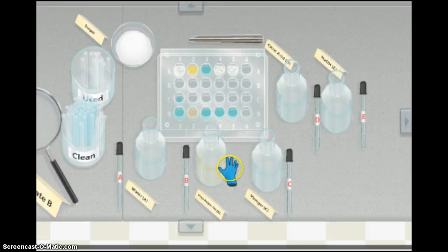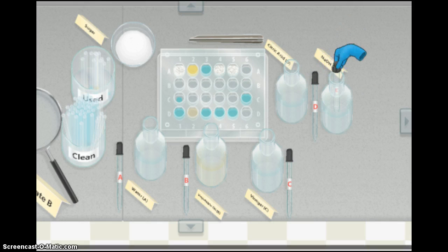All right, now I kind of want to try something else because remember how our vinegar didn't react with our baking soda, right? It didn't react very well. So I'm wondering if it's just not a strong enough acid to react. So I want to try citric acid and sodium hydroxide and see if that does anything. And the fun part about virtual labs is you can try anything and you don't have to worry about the safety. Whereas in real life, you'd actually have to get permission to try something because if not, you can fail the entire class. Seriously. You can fail an entire class for doing an unauthorized experiment in real life. And, I would have thought that one would have bubbled. All right, you don't have to write anything down for this on the paper. I just wanted to try it out.